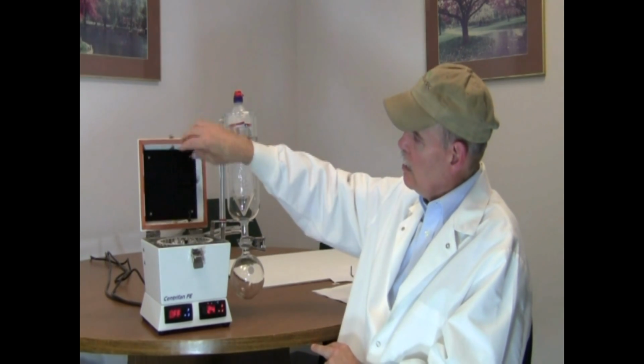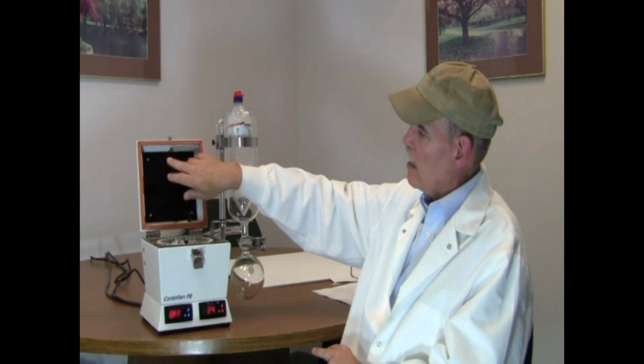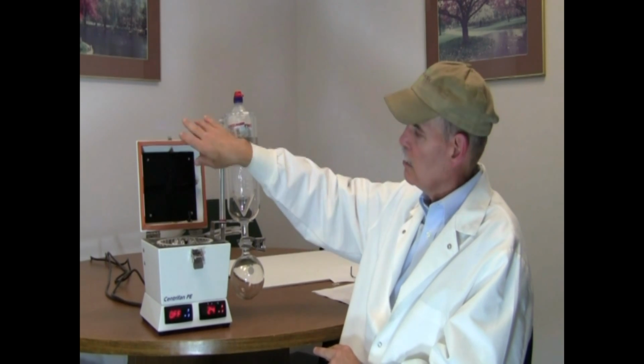max. If you want to evaporate at colder temperatures, you can take the whole Centrifan, put it in a cold room, set the temperature controller to 5 degrees, and you will be processing your samples, evaporating the solvent at 5 degrees. This works by controlling a heating element behind this black finned structure inside the lid.